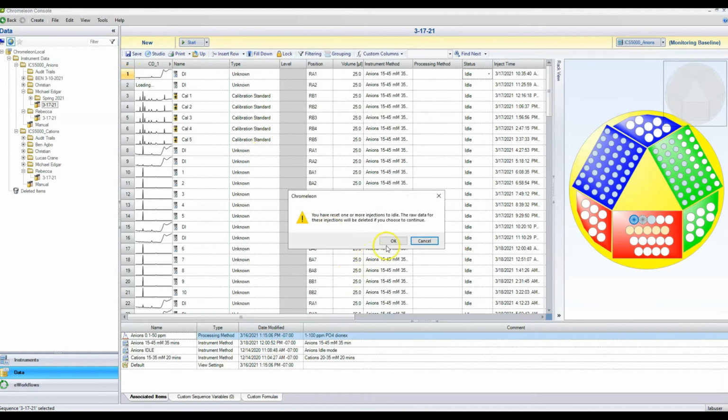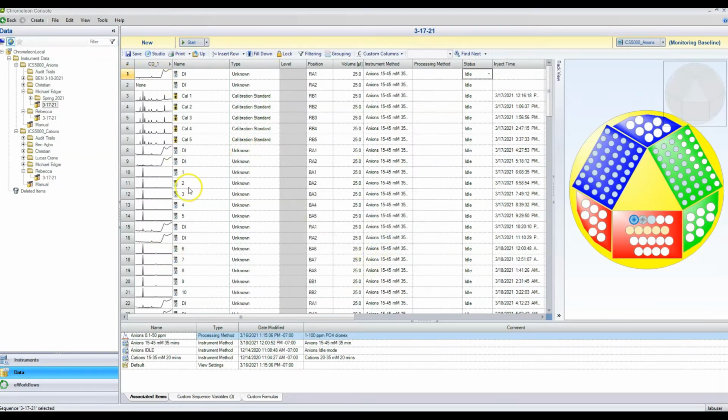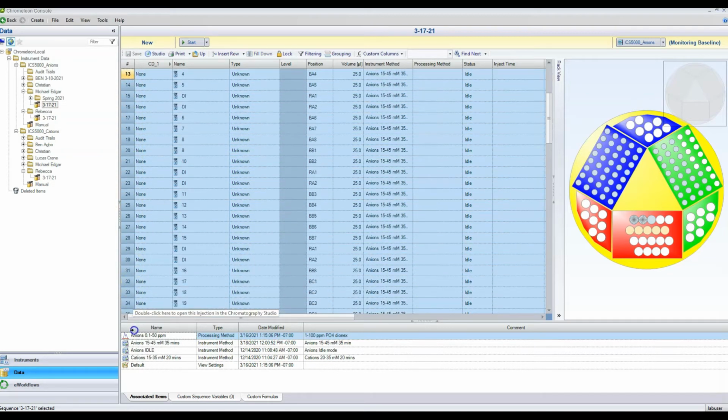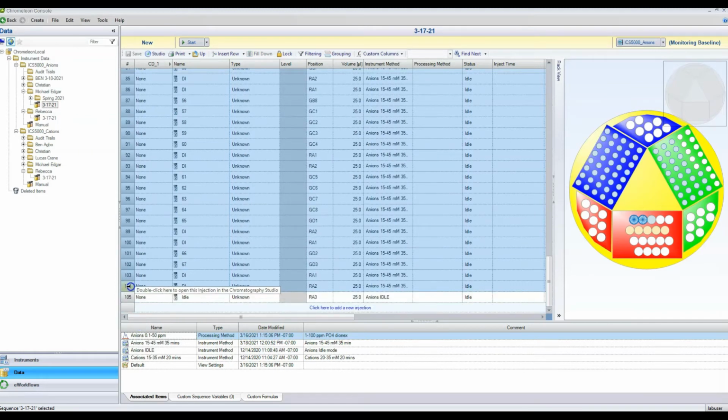And when I hit save, it's going to say, hey, I'm going to delete all your data. Yep, let's delete all that data. Now, once it loads, now I can actually start messing with these samples. Now, if you remember, I only had 3 samples. So I'm going to delete all of these extra samples that I definitely don't need. Just going to highlight them all and delete them.